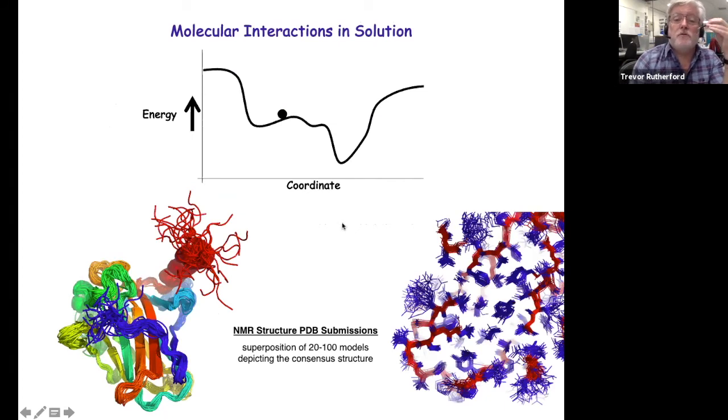The overall process, it's worth saying, is that we take a molecular geometric coordinate and minimize the energy of that system by simulating it. We start off at high energy, putting in high amounts of thermal energy, allowing everything to shake about and explore different conformational space.